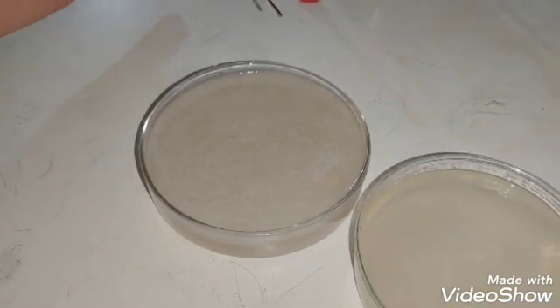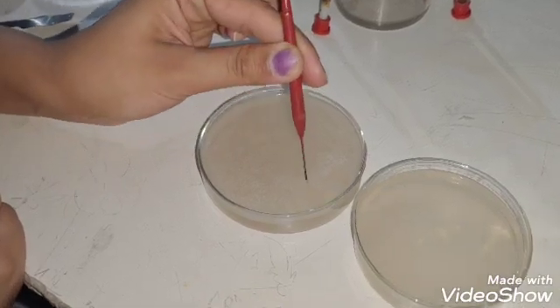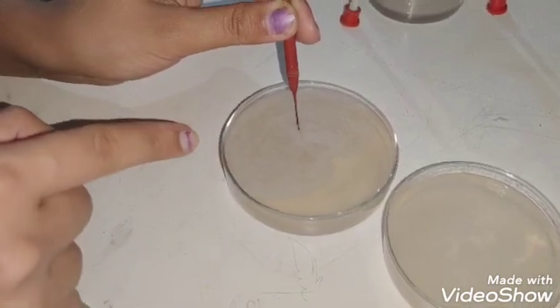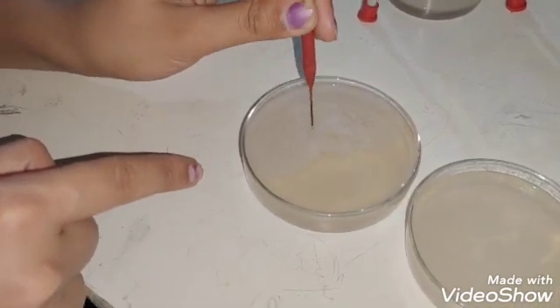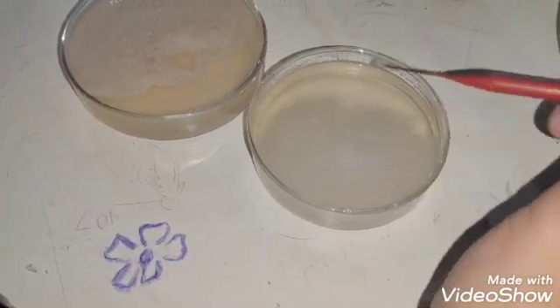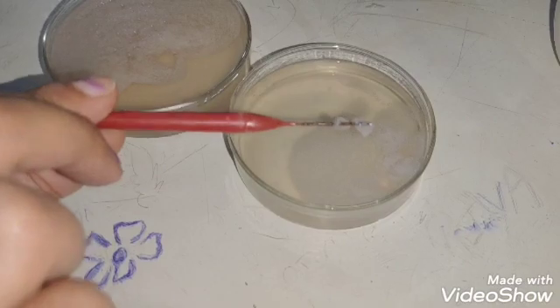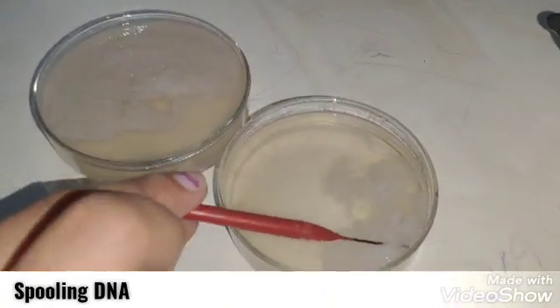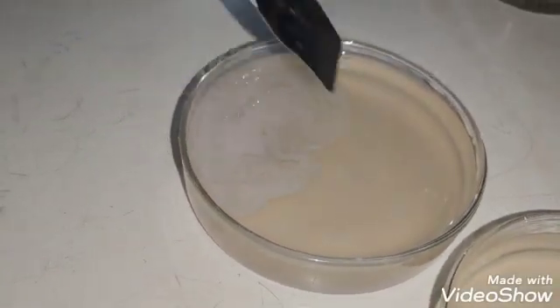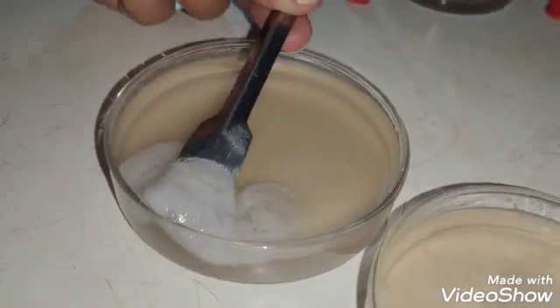Now, with the spooling technique, extract the DNA out of the solution. Here you can see the froth-like structure, which is actually the DNA. It has been extracted from the plant material. With the help of the spooling technique, you can finally have the DNA extract.